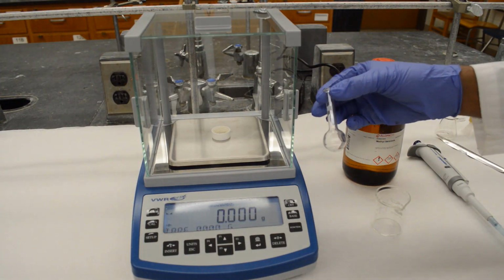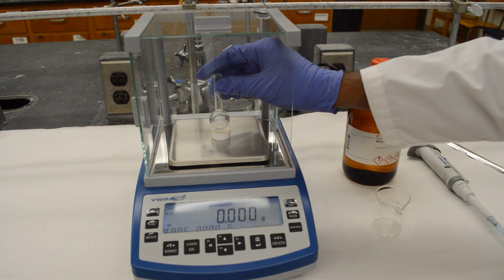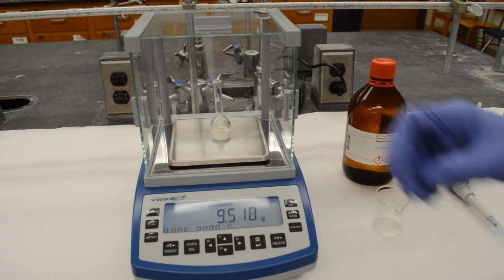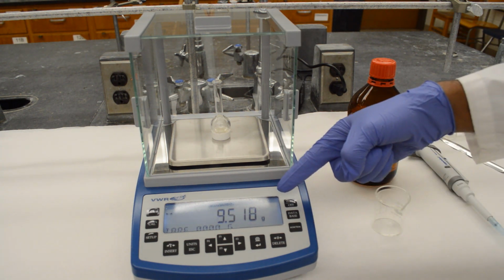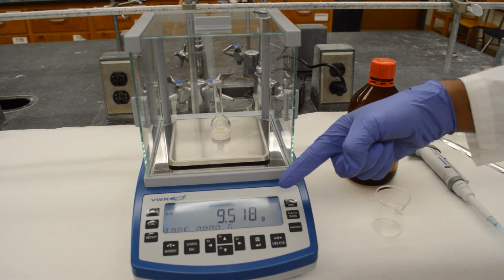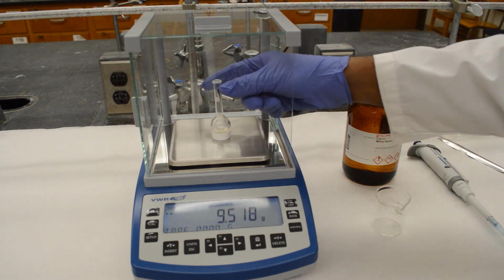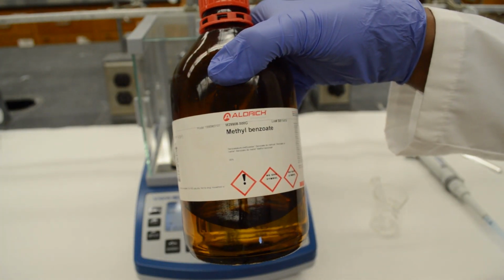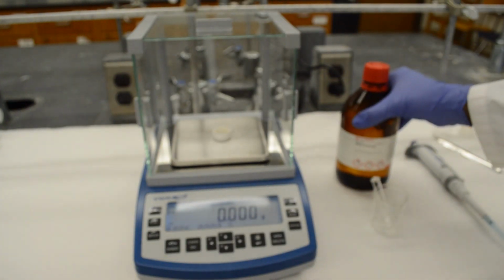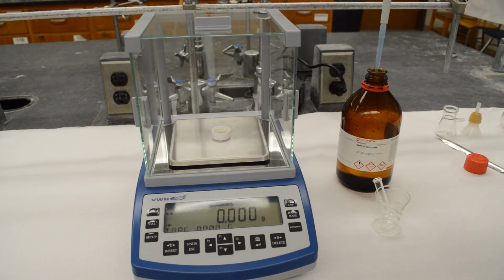Take a long neck round bottom flask and check the weight. Okay, that's the weight of the round bottom flask. Note this down for your calculation. Now I'm going to add the methyl benzoate. We need 0.5 ml. Here's 0.5.